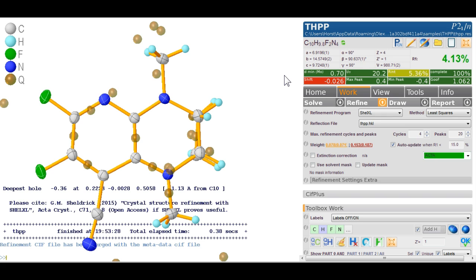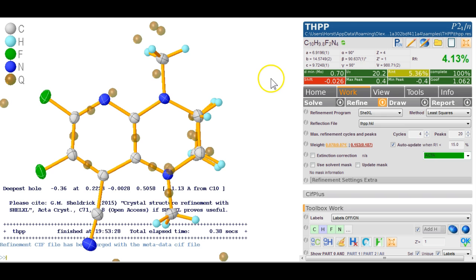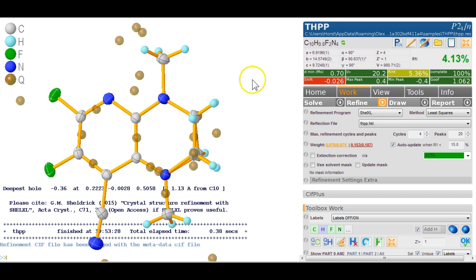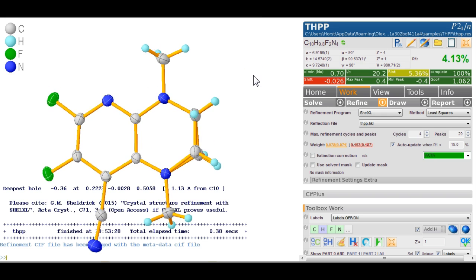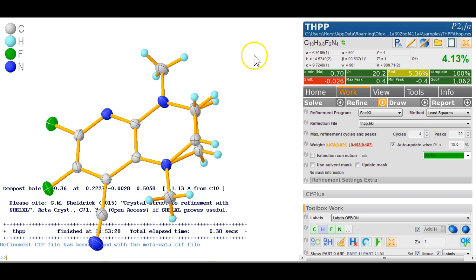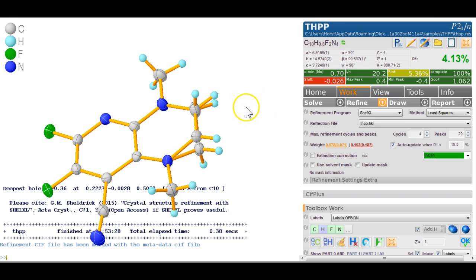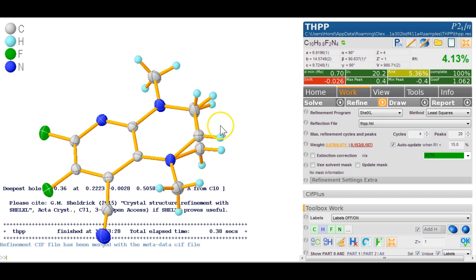Generally you don't ever need to do this because there's no reason to do this. The reason why I'm saying this is let's look at the structure control Q to hide those Q peaks again. There's actually a bit of disorder here so let's just for the moment pretend we haven't noticed that disorder yet.